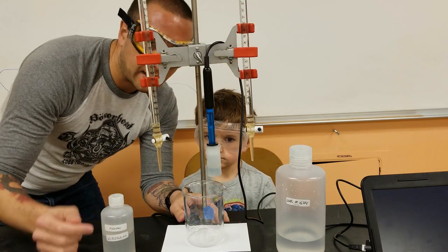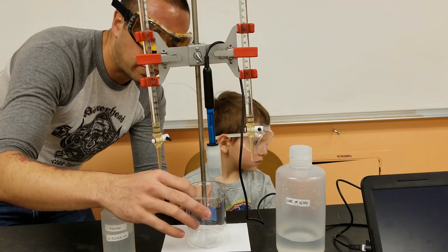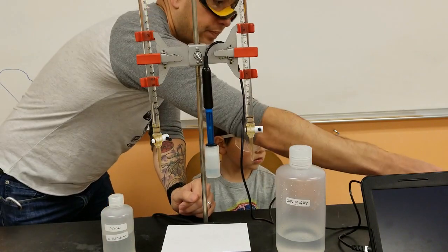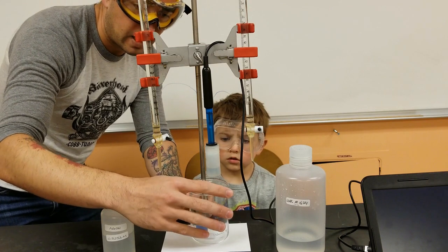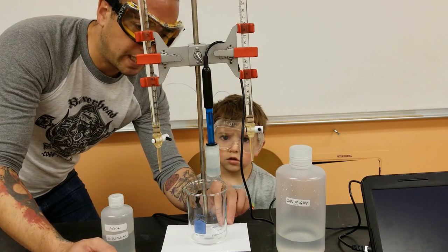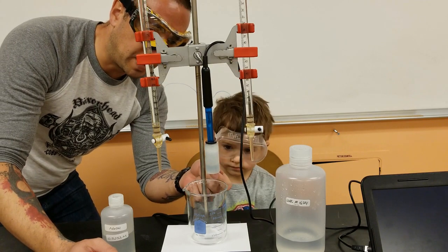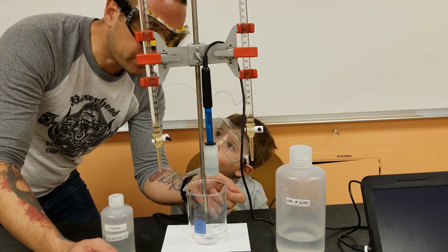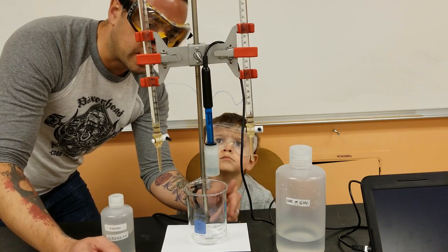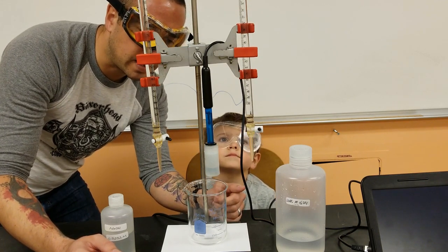Alright, so now we've got the base burette and the acid burette at 0 to start off. I'm going to pour out the waste beaker and bring in a fresh beaker. I've put in a magnetic stir bar to help us out. I'm going to start off by putting in some distilled water because the pH probe that we're using today needs to be submerged to work correctly. And then I'll be putting in about 10 milliliters of acid, put in some indicator, we'll use phenolphthalein today, and then put in sodium hydroxide until it changes color.